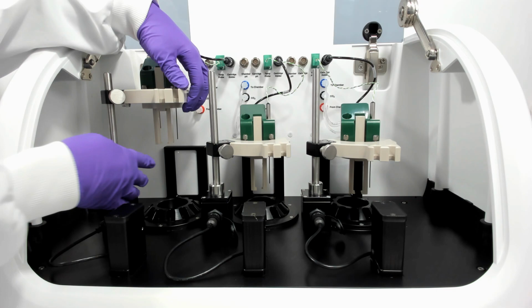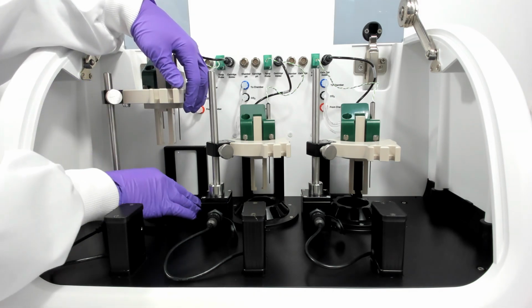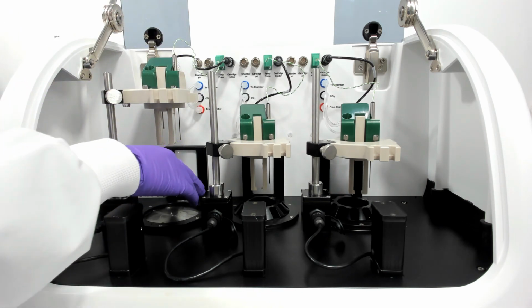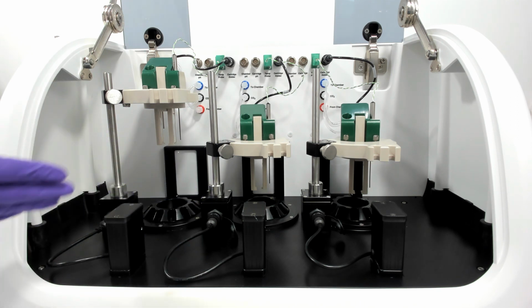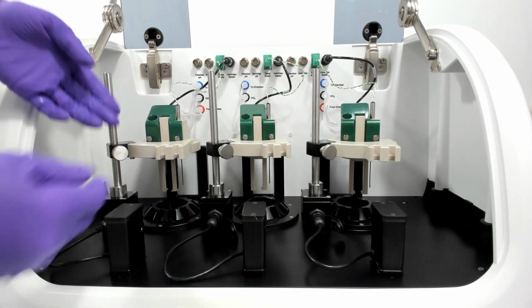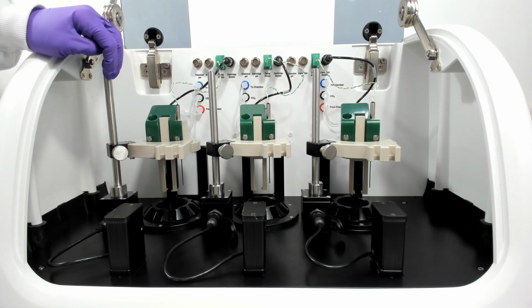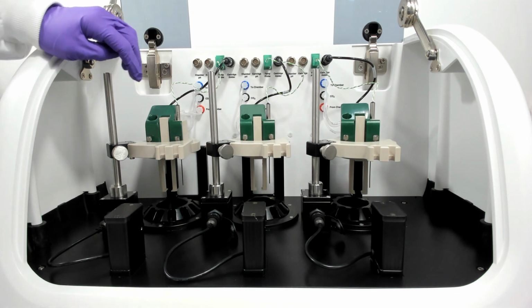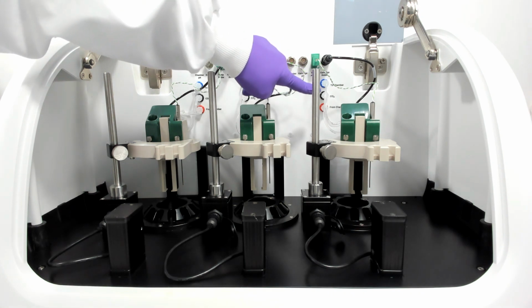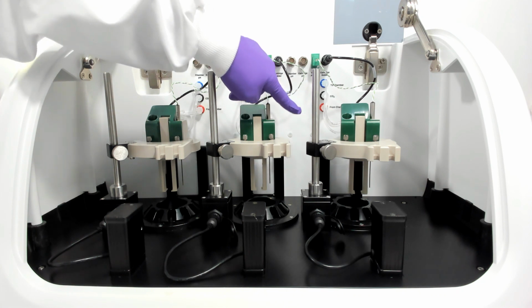We also have a backlight behind the chambers in order to create those crisp photos with the cameras as well. And we have a locating ring, which sits just above the heater plate on each of the chamber positions, and this allows us to change the chamber size to a small or a large vessel. We have external fluidics, which are running throughout the assay, and these are taking the liquid from the assay out to external flow-through vials to allow for sampling, and then they come back in a closed-loop system.